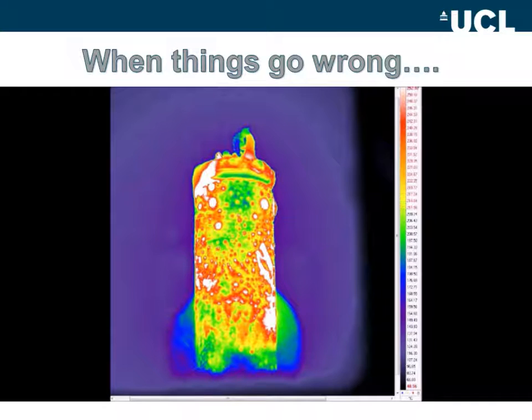And so we're keen to make sure that these rare events become even rarer, and our toolkit to tackle and understand these failure events really hinges significantly on the microscopy and tomography tools that I'm going to talk about today.